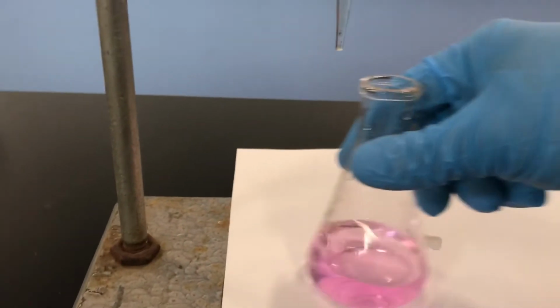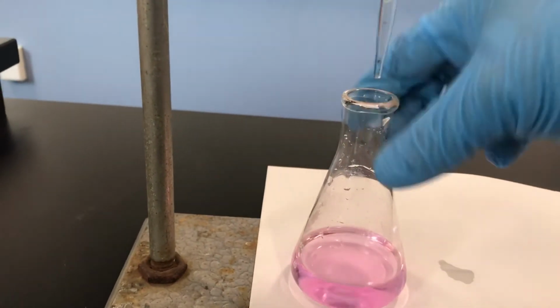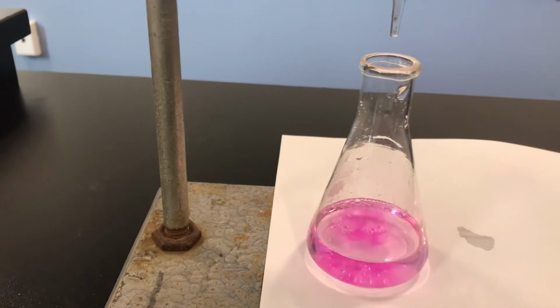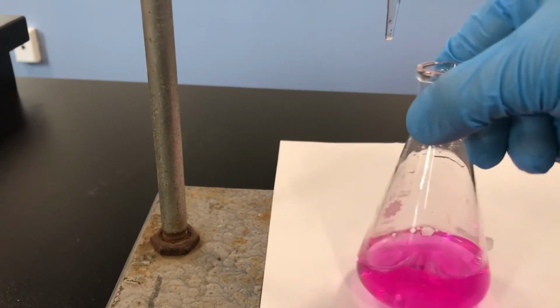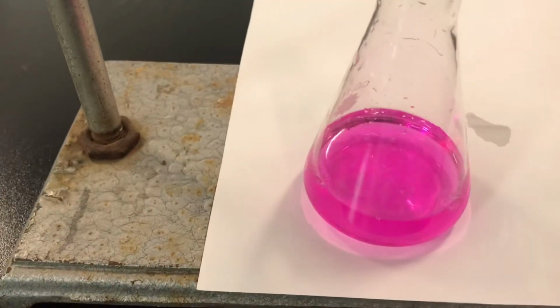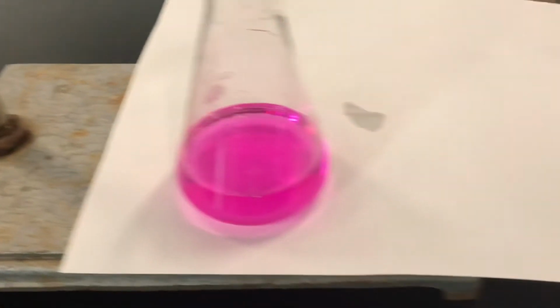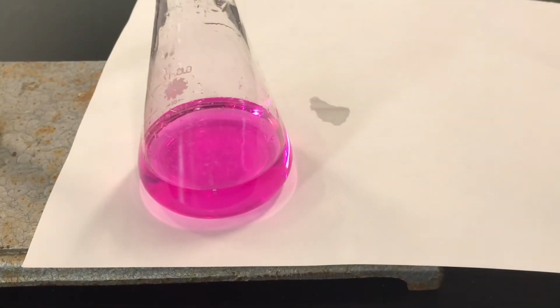Now, if we were to go too far, it would be very pink. So right now we have faint pink. I'm just going to put some more in there to show you what you don't want. So right here, that is very pink. We have gone too far. What you want is that faint pink that we saw a moment ago.